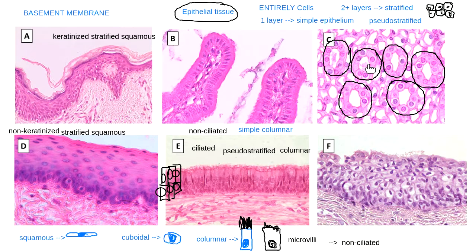Like someone mentioned in the chat, this kind of tissue we find in the kidneys. So this is the tube inside the kidney where, when you make urine, we dump it into these little holes. The cells that live next to those holes come in one layer, and these cells, as you can see in the picture, are about as wide as they are tall.